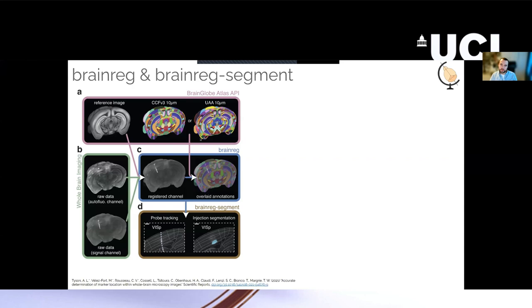And then once your data is being registered, you can segment out any structure. These tools were not specifically designed for Neuropixels probes, but you can use them for that. You can segment out 3D structures or for a probe, you can segment out a 1D structure.